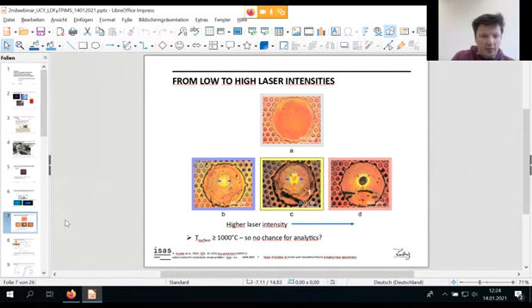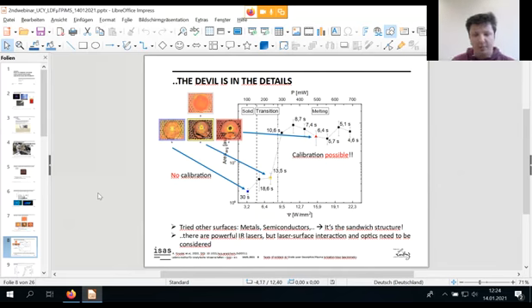And we realized, okay, let's see what the mass spectrometer says. And in fact, the ion signal increased with a higher surface temperature. That was quite an interesting fact, because it's not only a question of laser intensity, but as you can see, we also decreased the application time from about 30 seconds to even 4 seconds.